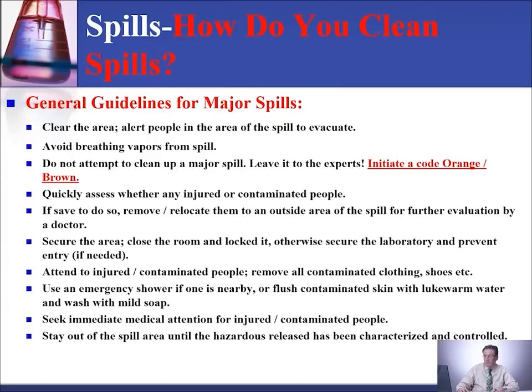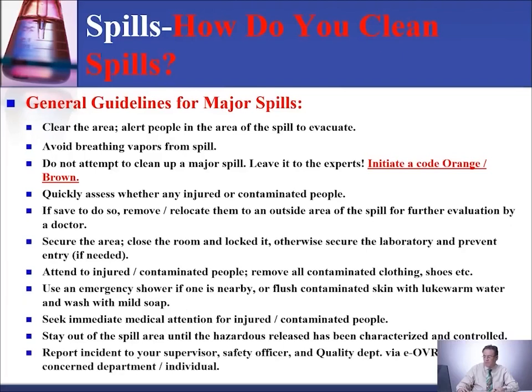Stay out of the spill area until the hazard released has been characterized and controlled. Report the incident to your supervisor, safety officer, or the quality department via EOVR and/or concerned departments or individuals, or follow your institution policy regarding that.